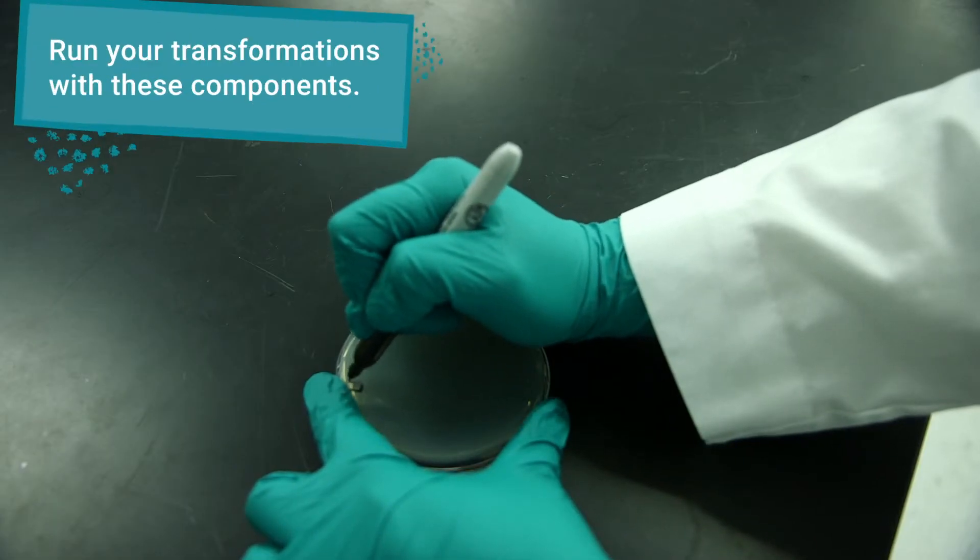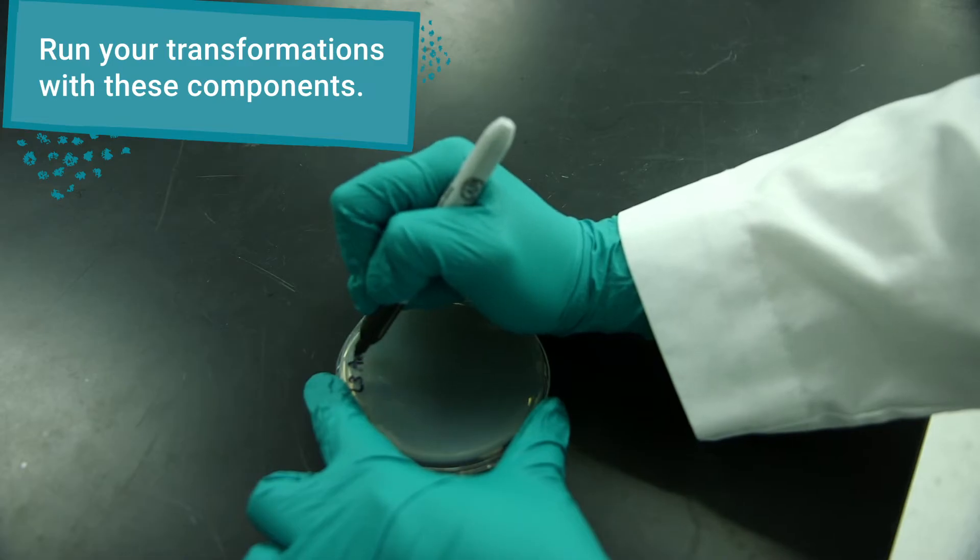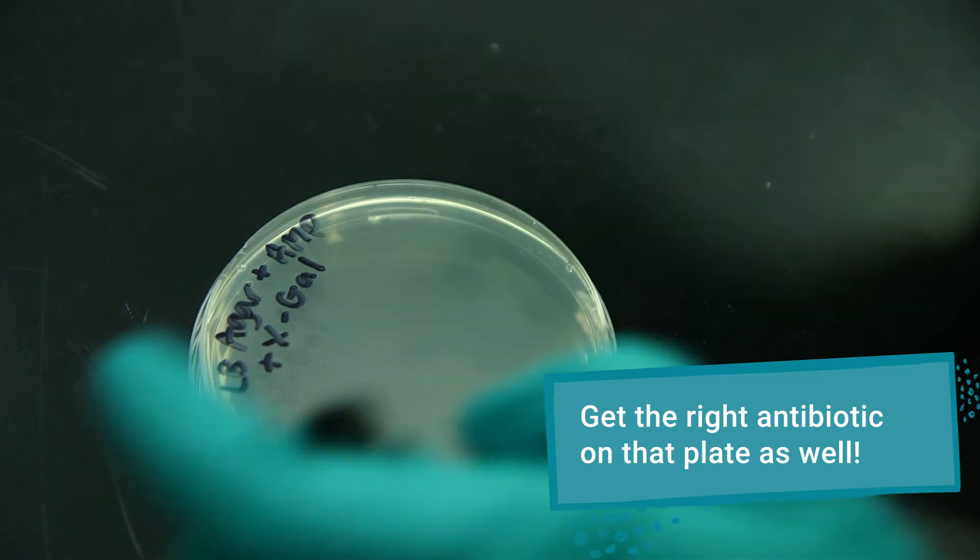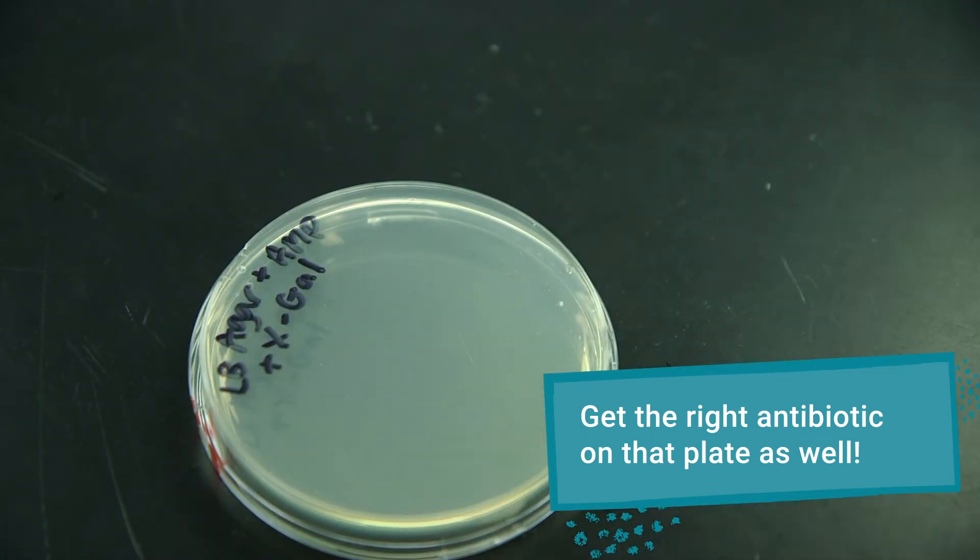Using these components, you can run your ligations and transformations as you typically would. When you're ready to plate the cells, make sure you use plates that are treated with the antibiotic you're using as a marker.